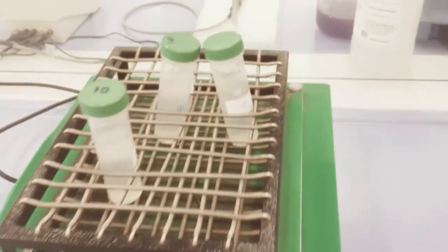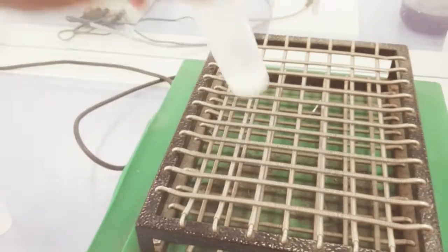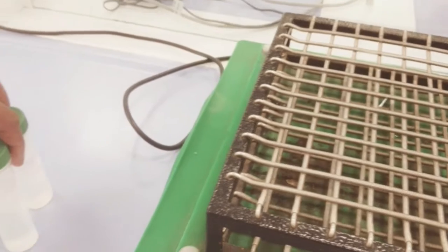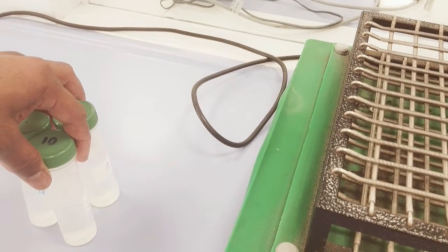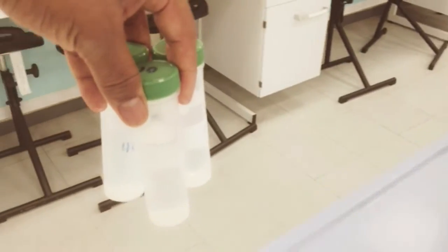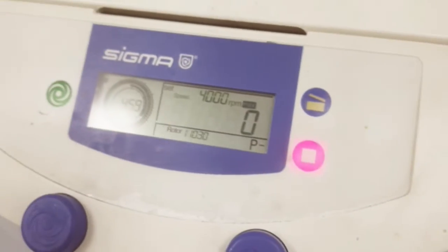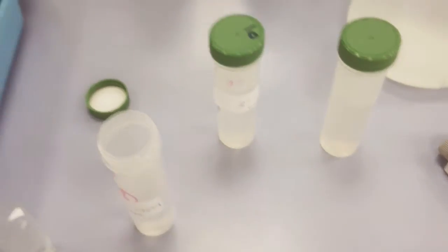Now after 3 hours we'll take out the samples and check the removal. Before this, we have to take the sample, centrifuge it, and then check the removal. So we have added our vials and we will centrifuge. After centrifugation, the solution looks very clear. Now I have transferred the sample from the first vial.